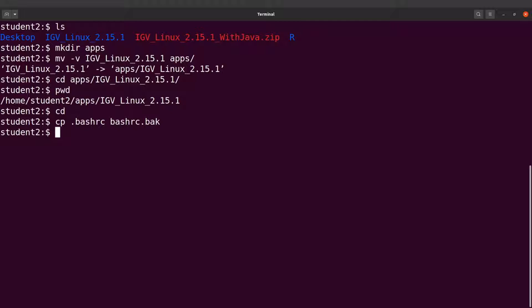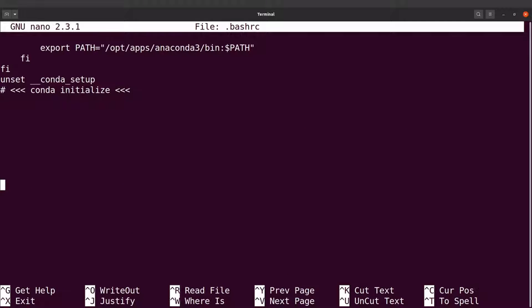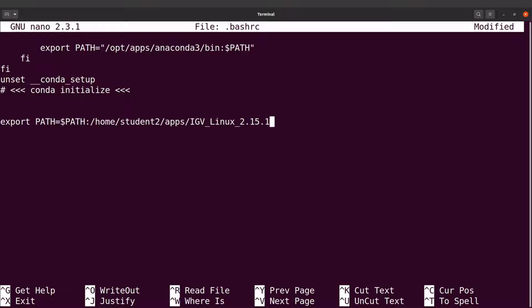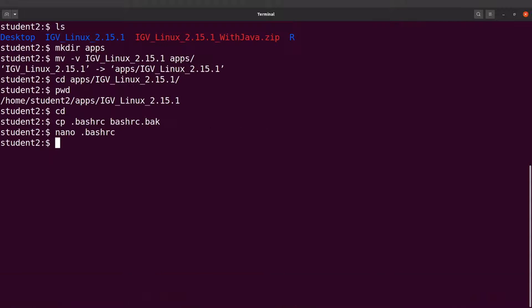I'll open .bashrc with nano — you can also use vi or any text editor. Scrolling down to a blank space, I'll add the line: export PATH=$PATH:/path/to/igv. Then I'll press Ctrl+X and type Y to save the changes. Now I'll open a new terminal and run IGV by calling only the script name.